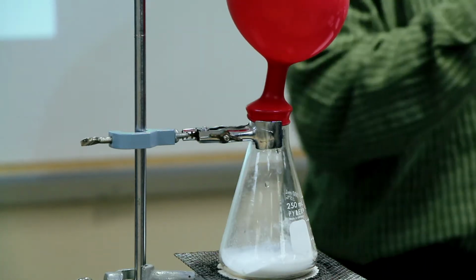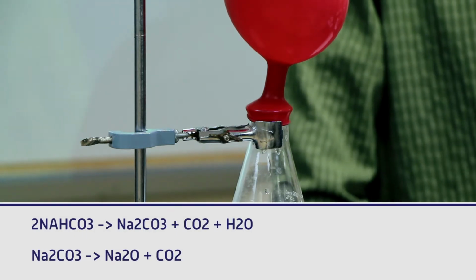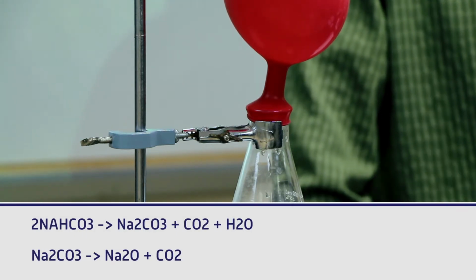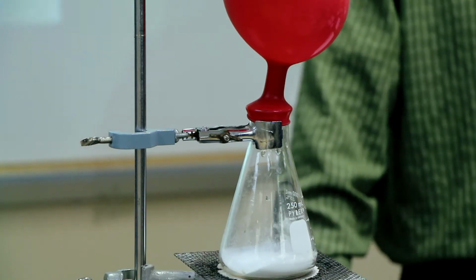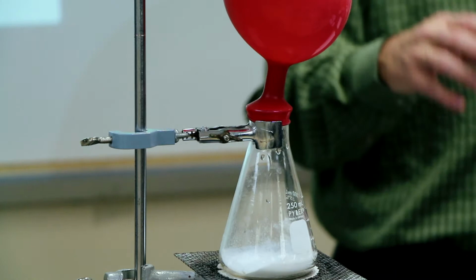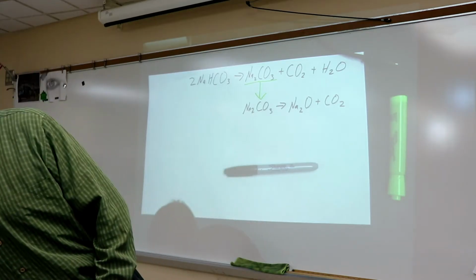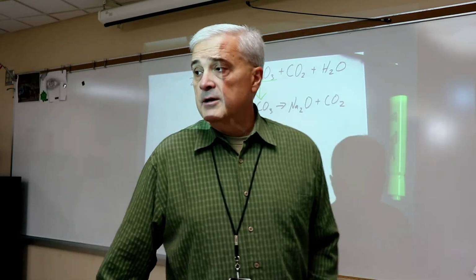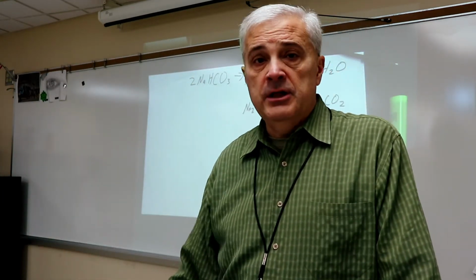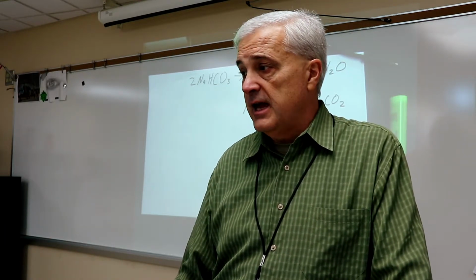So we start with one compound, sodium bicarbonate. We get sodium carbonate and carbon dioxide and water. The balloon is filling with gas. I can turn the heat off, and it will continue to increase a little bit for a moment longer. As the powder is still hot, it's still decomposing, it's still producing gas.